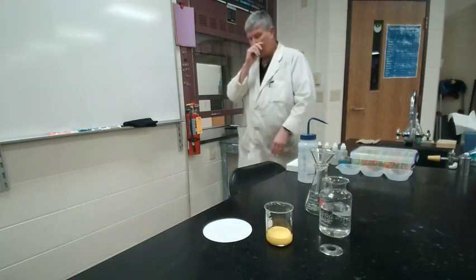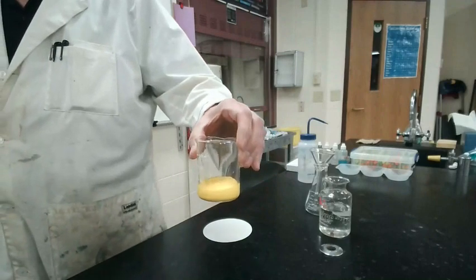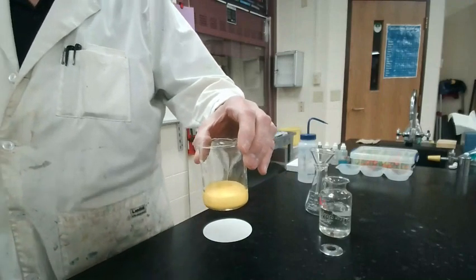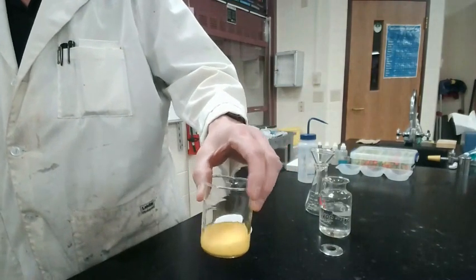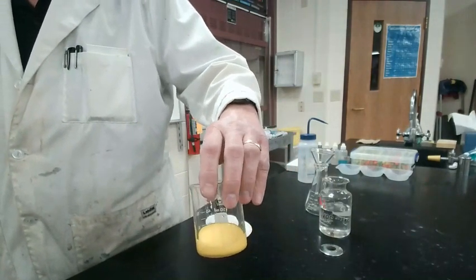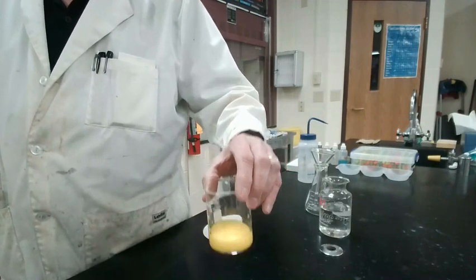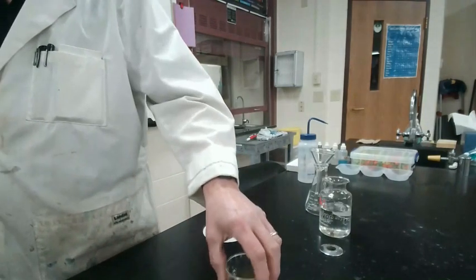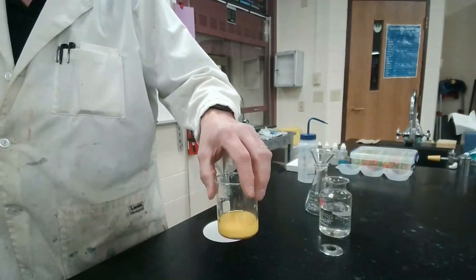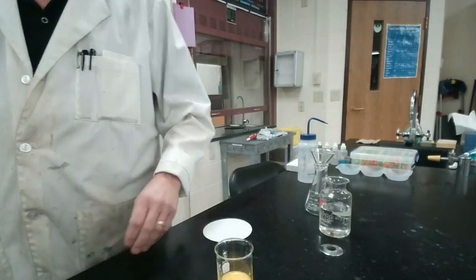Okay, so now you need to make observations of this sample based on what you see here. Again, no odor. Tell me what color you see. There's some particles floating around in there, ladies and gentlemen. Now I am going to let this sit for the next few minutes. Just going to let it sit, and we'll come back and pick up the video in just a minute.